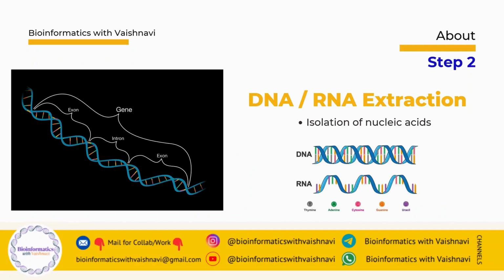The next step is nucleic acid extraction. From the sample, we extract DNA or RNA depending on the experiment we are doing. This step is called nucleic acid extraction. The goal is to isolate pure DNA or RNA and remove proteins, lipids, and contaminations. Good extraction is very important because poor quality DNA or RNA will affect all downstream steps.